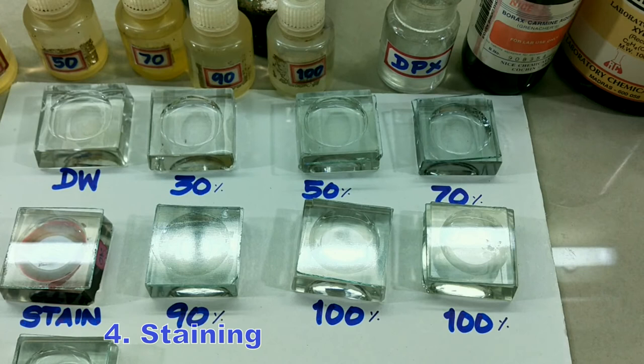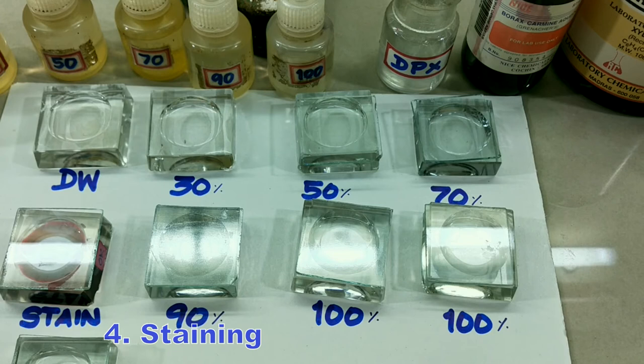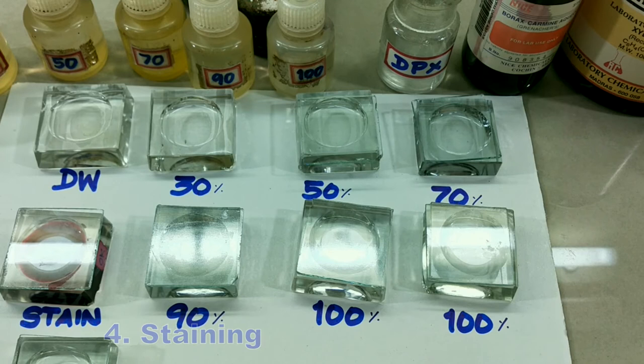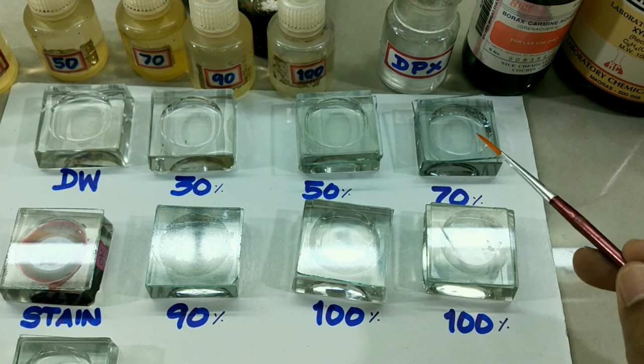In the stain we keep it for only two or three minutes, not five minutes. Suppose excess stain is present — we shall wash it or put the material in acid alcohol, that is 70% alcohol with two or three drops of acetic acid, then gently wash so that excess stain is removed.